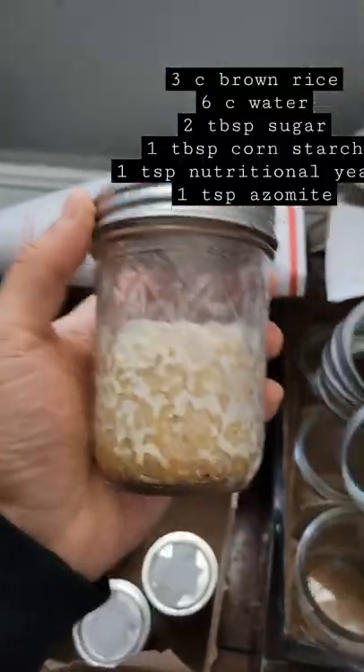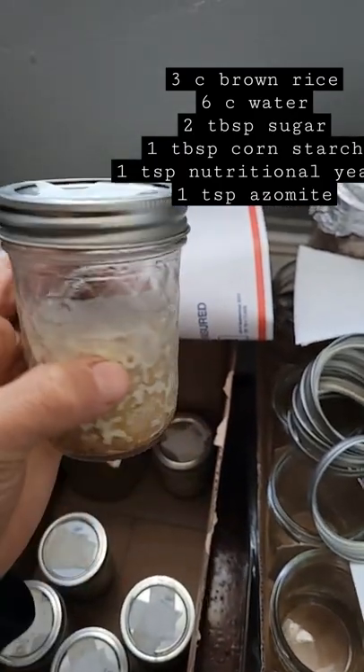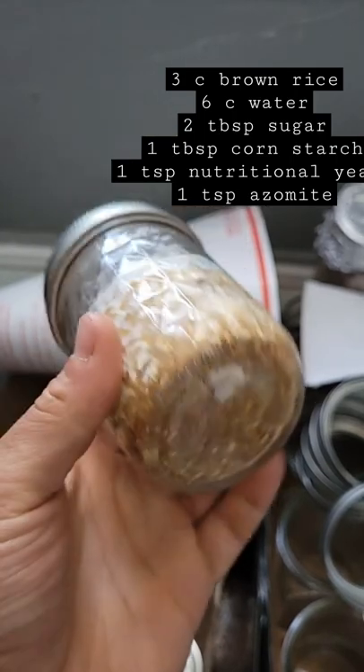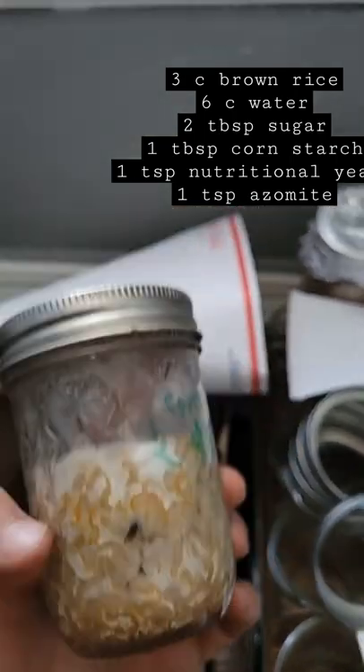The video I made on the low-tech cordyceps cultivation got a lot of views, so I figured I'd do one on the more high-tech cordyceps cultivation that I'm doing. Here I've got a bunch of jars of brown rice substrate that I've inoculated with some homemade liquid culture, and you can see the sort of orange pigment and white mycelium growing on the rice medium. I'll put the recipe up here.